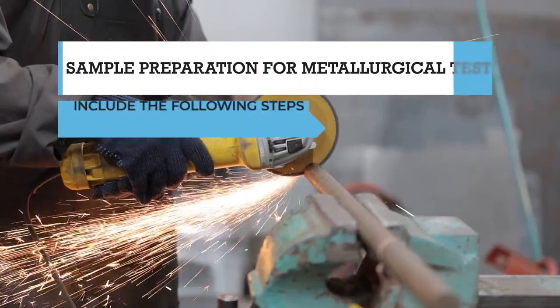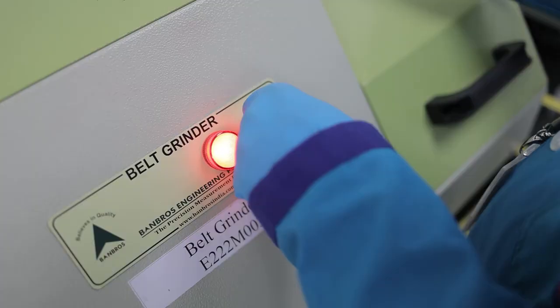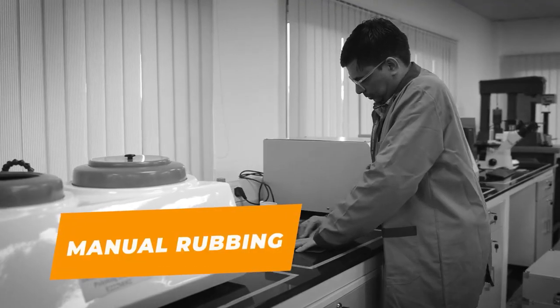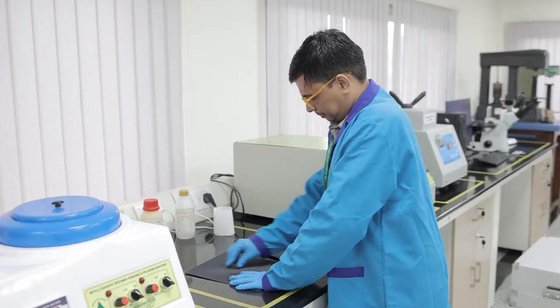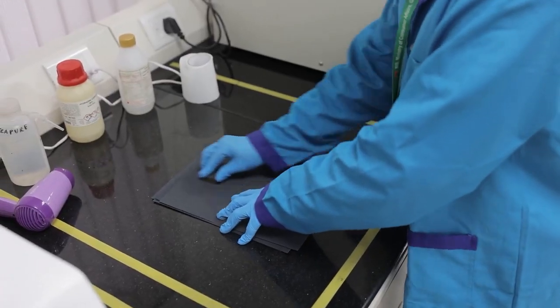Sample preparation for metallurgical tests includes the following steps. Grinding. The sample is ground using progressively finer abrasive papers on a belt grinder. This is followed by manual rubbing on abrasive paper of various grit sizes. This step removes surface deformations or damage from the cutting process and ensures a flat, smooth surface for further preparation.